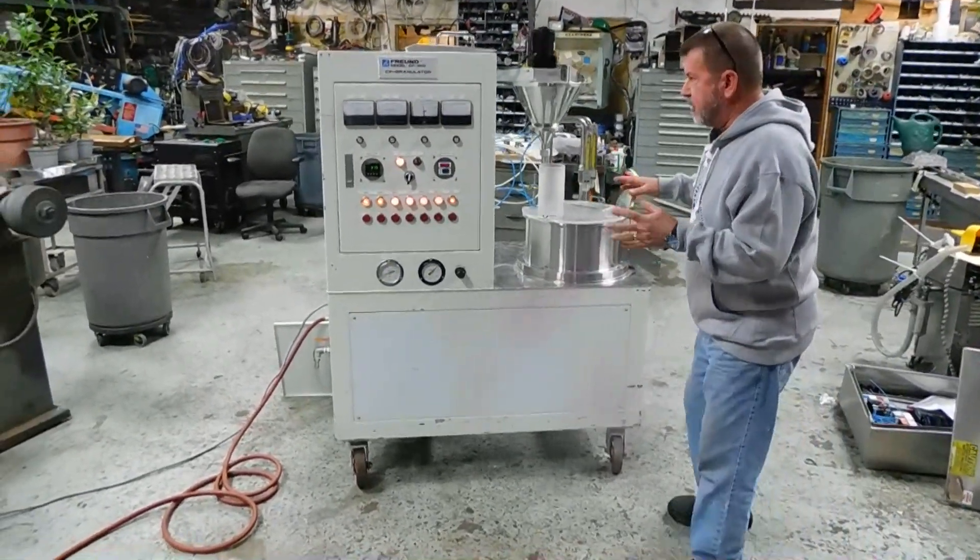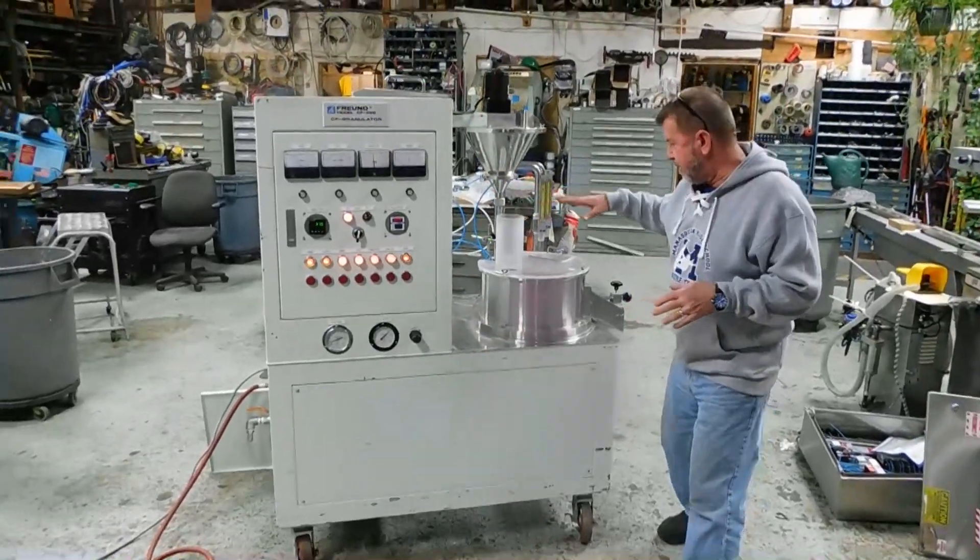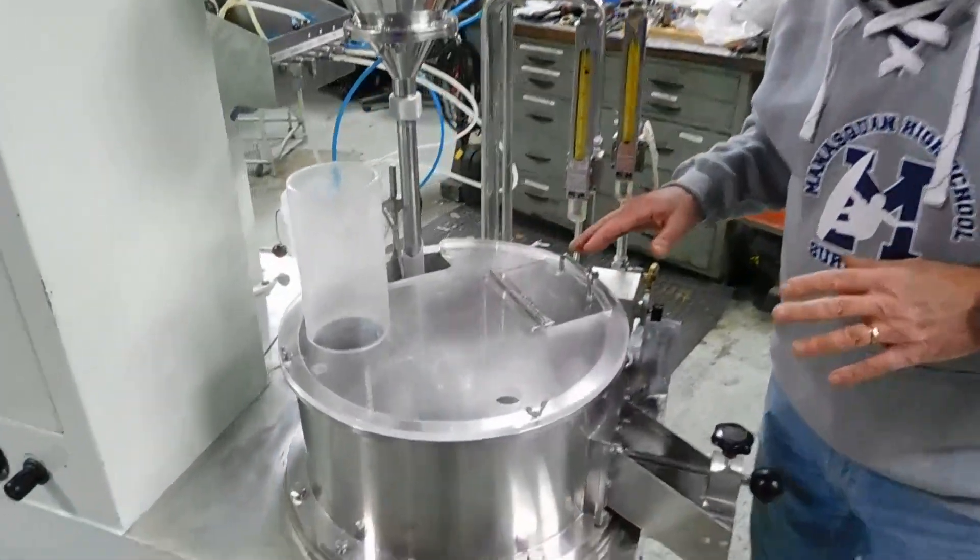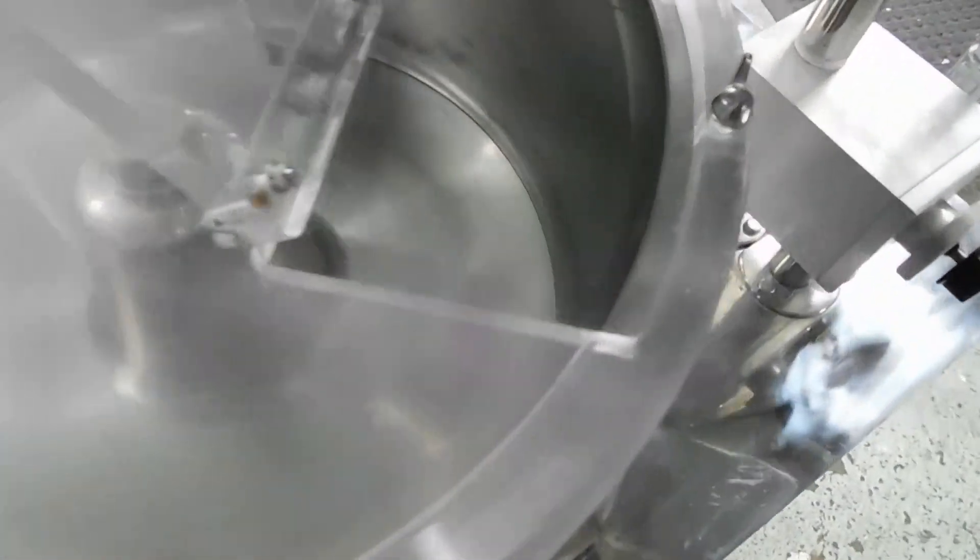We're going to take you through some of the features over here. We're going to come back to our control panel in a minute. This is the actual spray coating bowl, and you'll see we're operating right now. You can see the bowl turning.